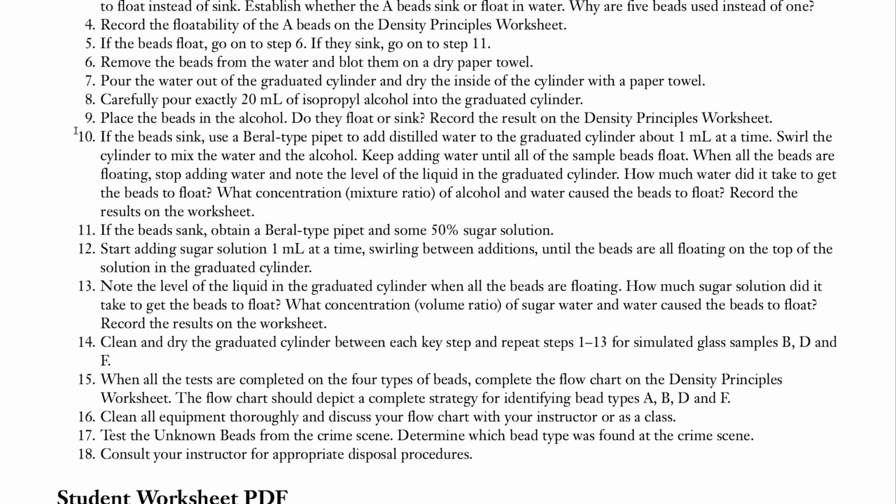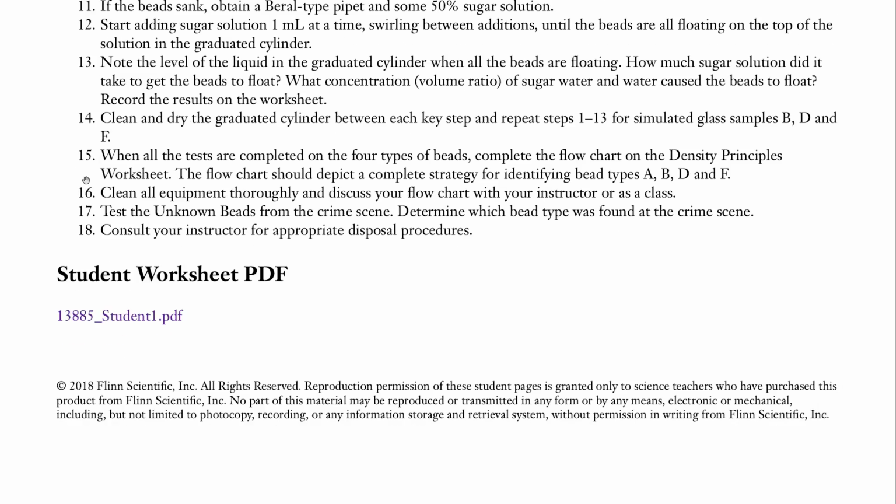Okay. Then we're going to go down here. We're going to clean all the equipment thoroughly, around 16, and discuss your flowchart with your instructor or as a class. Now we get to test the unknown beads from the crime scene, determine which bead type was found at the crime scene, and consult your instructor for appropriate disposal procedures.